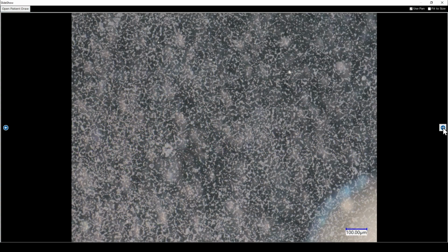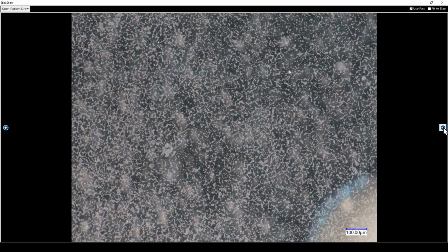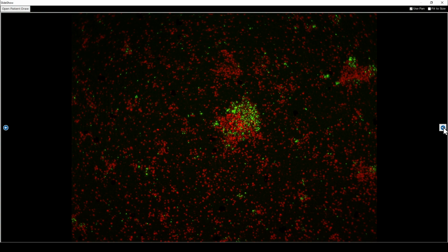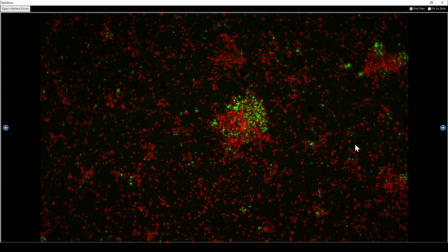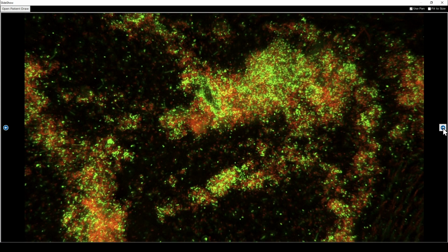I thought I'd give a little conceptual introduction into confocal microscopy, just for those not totally familiar. When you look at these specimens under the electron microscope, yes, you get a very impressive view of what the bacteria look like. But using confocal microscopes, you get another completely different perspective because you don't have to dehydrate the specimen. And depending on the probes you use, you can detect carbohydrate, DNA, live bacteria, dead bacteria.